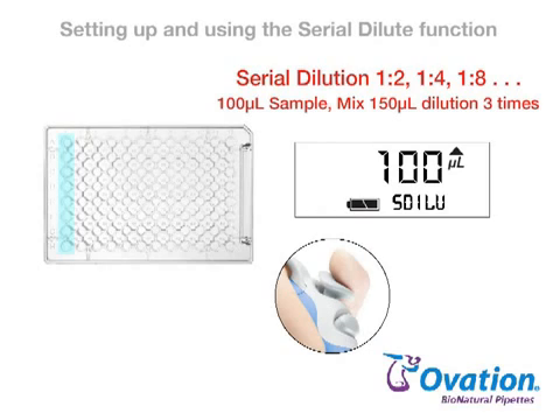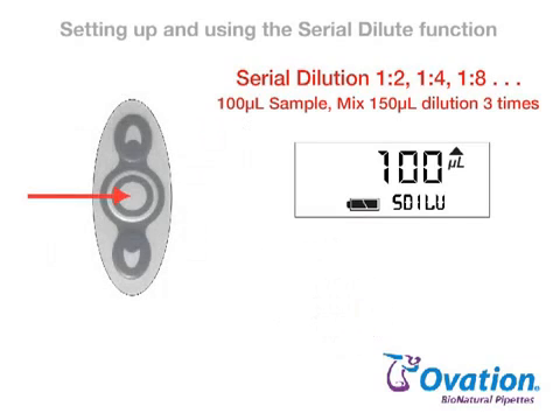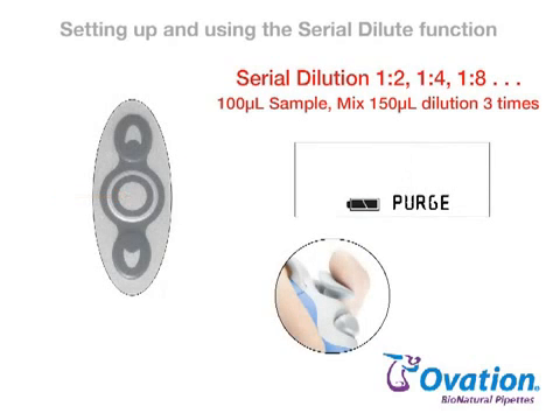Move tips to the next row and press the pipetting trigger to dispense and mix the next dilution. Continue until all dilutions are prepared. To empty the tips of liquid after the final dilution is made, press the center button and PURGE appears on the display. Press and release the pipetting trigger to dispense liquid into an appropriate container.